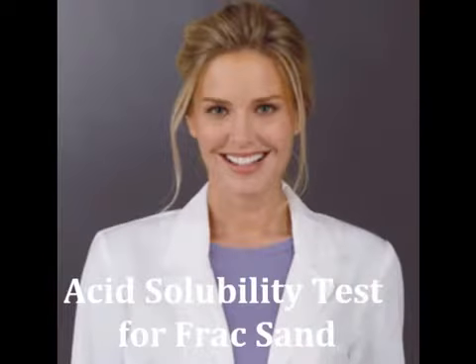So this is a fairly involved procedure done by an experienced chemist for best results. You need to follow the procedures exactly. There's very detailed procedures for this test, and you need to use good laboratory techniques.